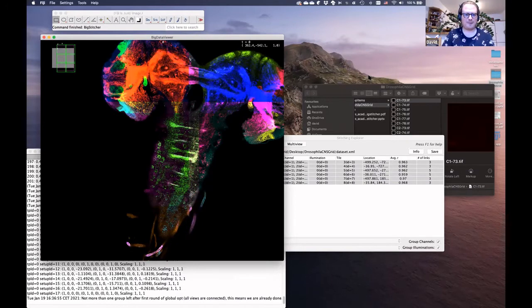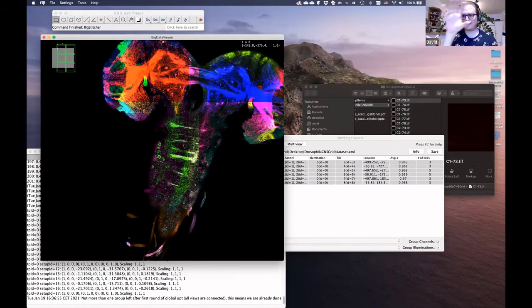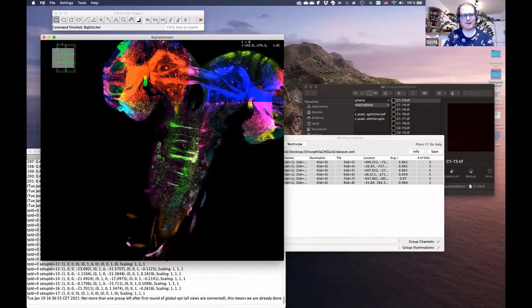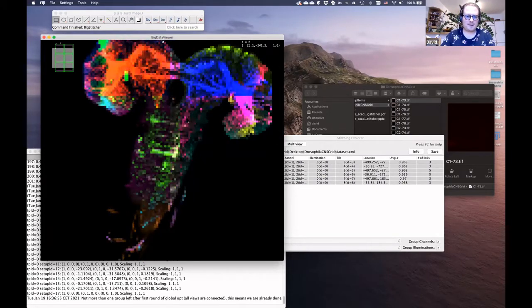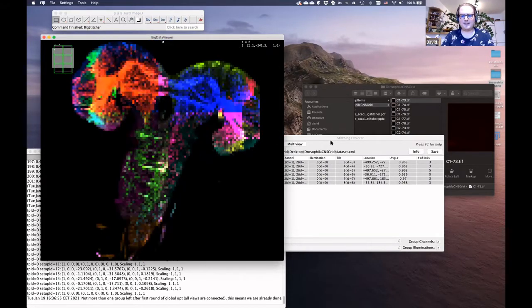After reviewing the pairwise links, click Apply and run the global optimization. We have various strategies for global optimization, but typically the default works well — it includes iterative removal of disagreeing links and similar checks, and doesn't significantly increase processing time. After a moment, all tiles snap neatly into place and it already looks pretty nice as an aligned dataset.